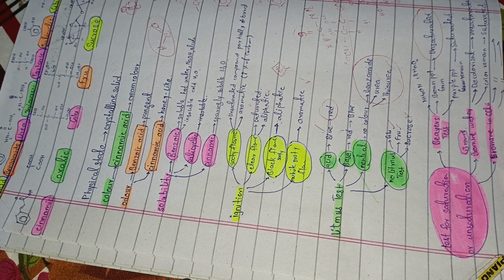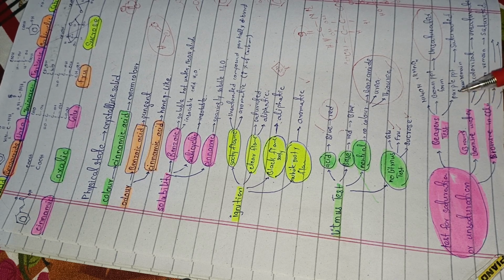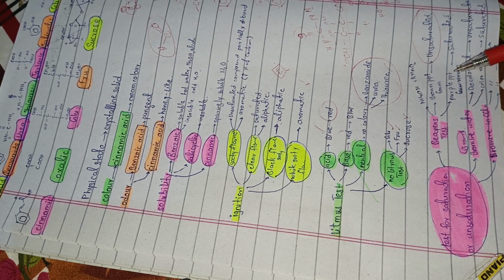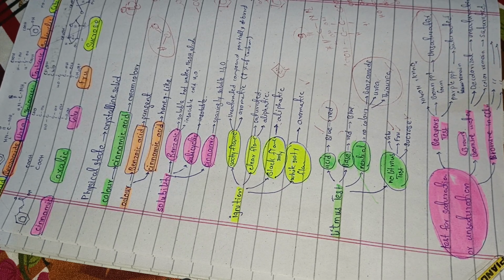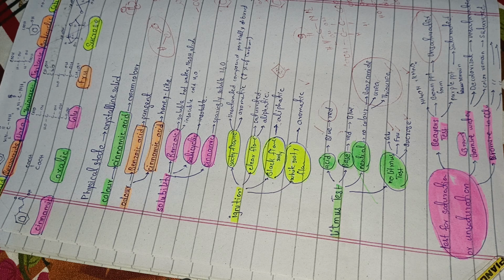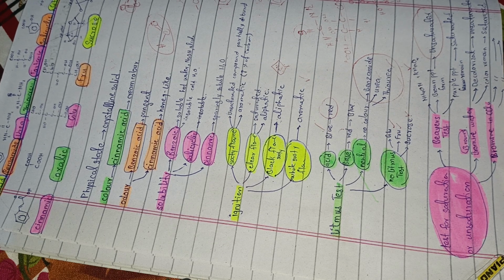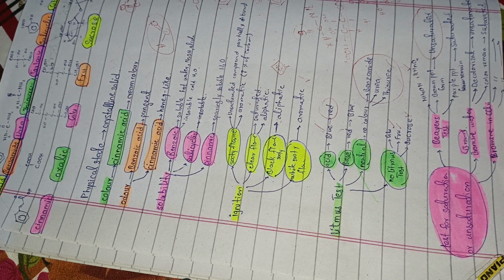This test will be helpful to you, because in all of these practicals you have to observe the brown color. Second, if a purple color appears, for example if you have a compound and it gives a purple color, then you will know that it is a saturated compound. Bayer reagent also has a purple color, so for a saturated compound the color is not going to change. The purple color comes from the KMnO4, so the reagent becomes purple. If you have a saturated compound, this purple color remains the same. If you have an unsaturated compound, this color is going to change into a brownish color.